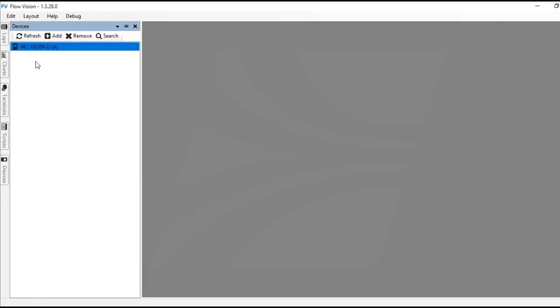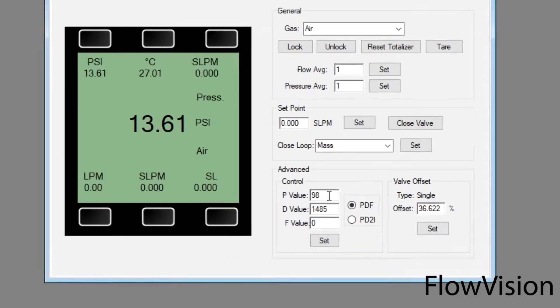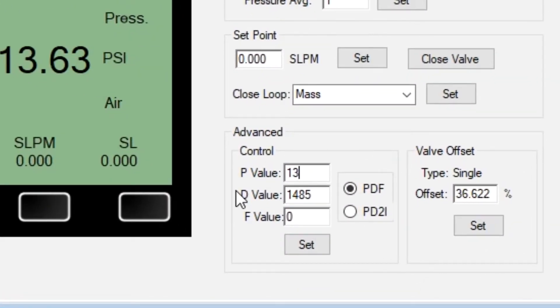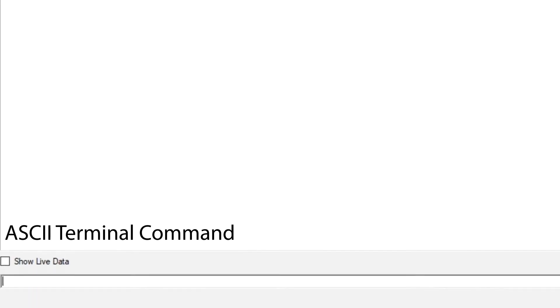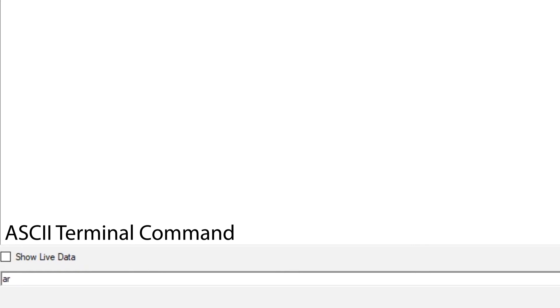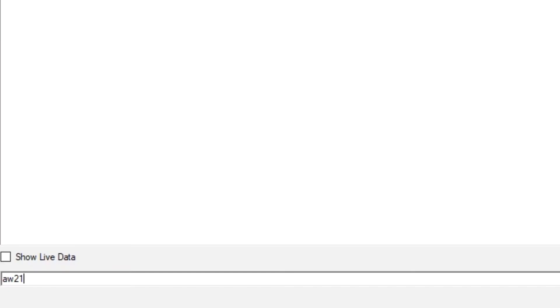This can be done through FlowVision from AlleyCat by entering the new values into their respective boxes on the instrument panel, or through an ASCII terminal command program by entering AR21 and AR22 to receive your P and D values respectively, then entering AW21 equals your new value for P and AW22 equals your new value for D to change them.